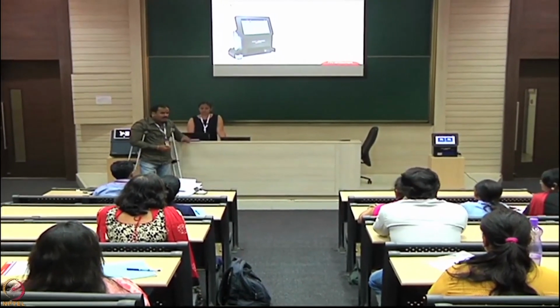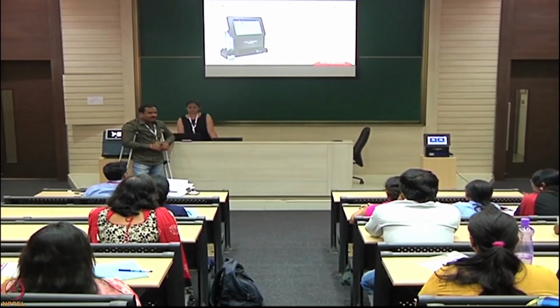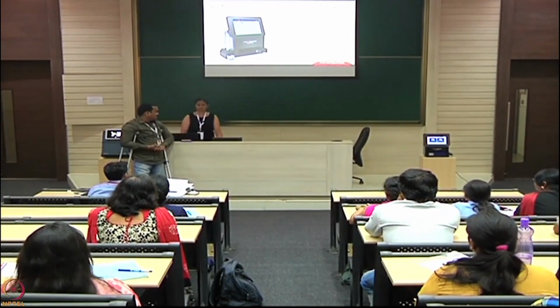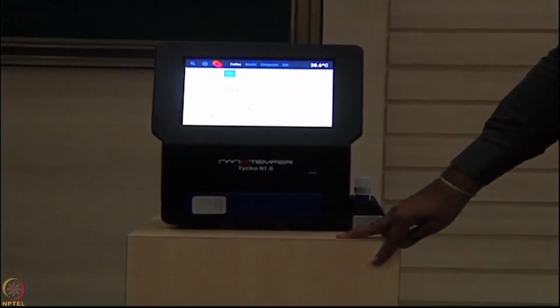Quickly, maybe 3 minutes as I said, she will load 1 sample quickly. By the time she comes here, the sample will be done there. So you just load 1 sample. We are just showing the previous data to get an understanding, because we had only 1 BSA.